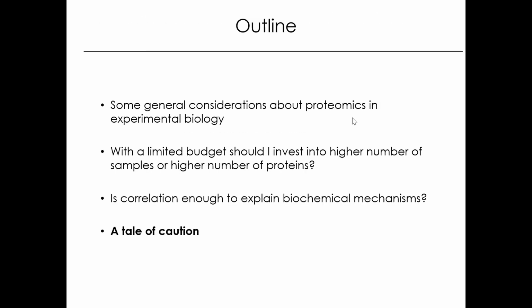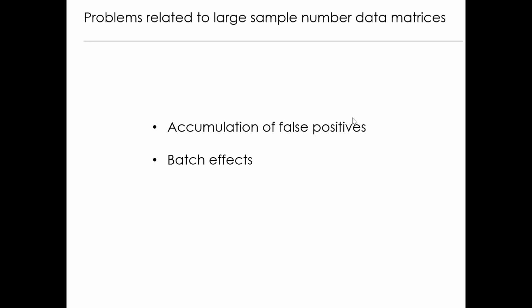So now I have the last 2-3 minutes. I have a couple of cautions. We now established, I think, that we want to generate increasingly large data matrices with lots of proteins, lots of samples, and that these really have useful information that we can mine.